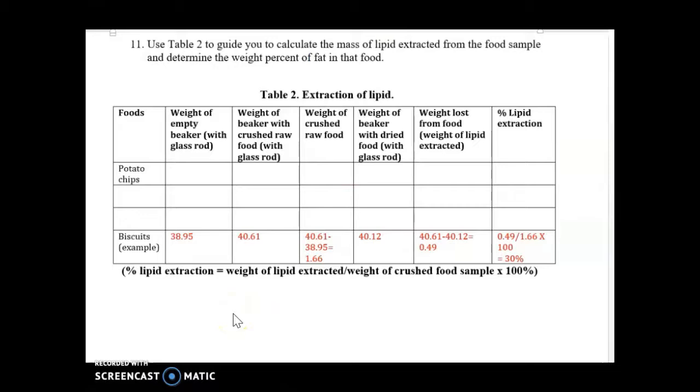Okay, now we shall look at the aspect of direct mass calculation. The direct mass calculation method to determine lipid present in a food sample could actually quantify the value in either a number or in percentage. This is the experiment.